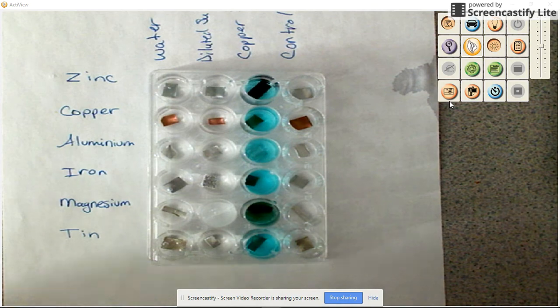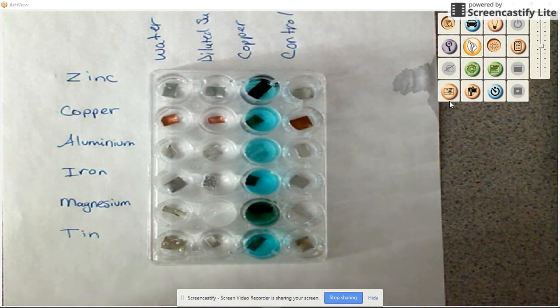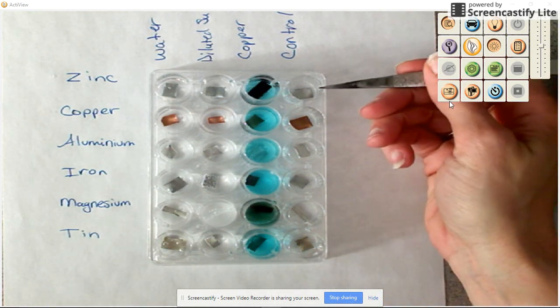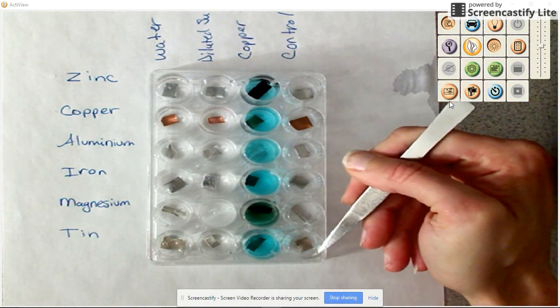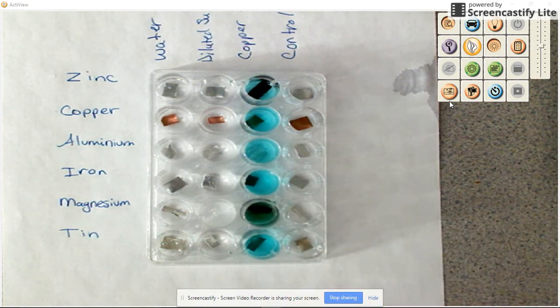One interesting thing we discussed in class is that some of these metals that are shiny on their own get their luster changed. They don't necessarily change color, but maybe they appear shinier. So like that first layer that has oxidized has been kind of taken away. So you can compare them to the control. This is what it looked like before we added any liquid at all. And then when it's sitting in the liquid, what it's actually looking like.